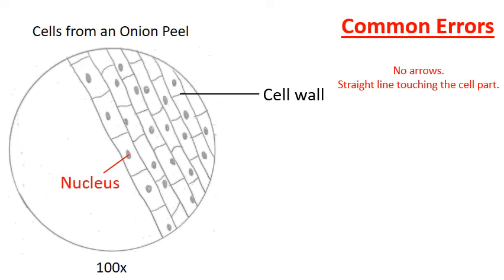Another common error would be labeling the nucleus inside of the field of view. The labels really should be on the outside for a very simple reason. Whatever you include inside of your field of view, you are claiming that you can actually see underneath the microscope. You can't actually see the word nucleus typed underneath the microscope. So a straight line touching the nucleus off to the side of the field of view.